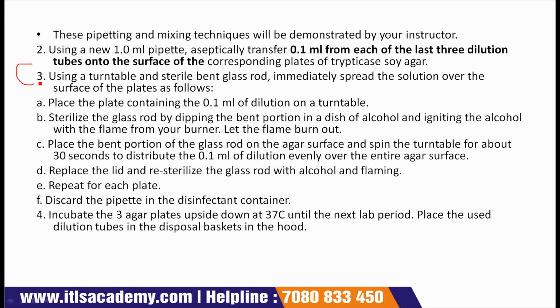Third point is, using a turntable and a sterile bent glass rod, immediately spread the solution over the surface of the plates as follows. The process for the spreading is given in these steps.